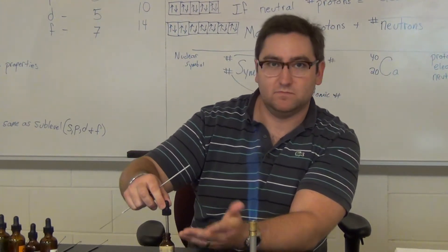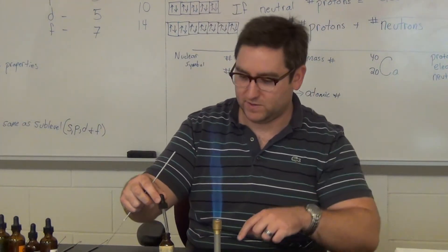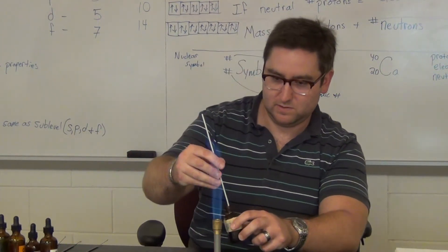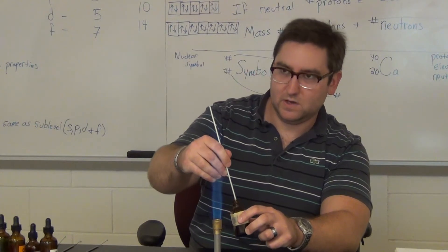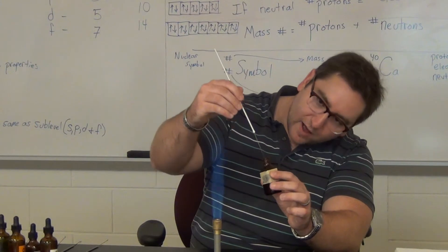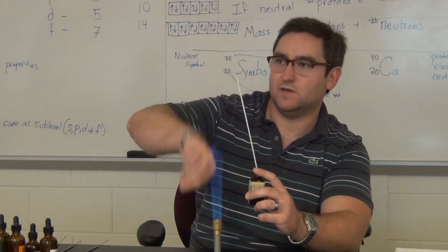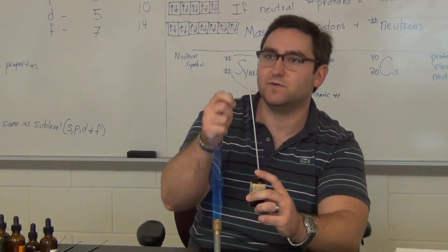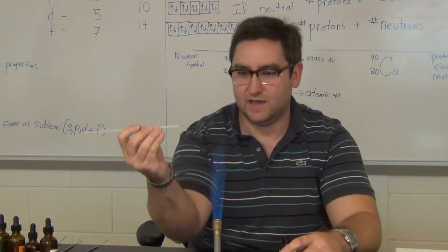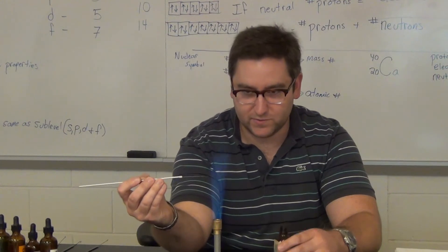I'm going to do each of them three or four times so you can get a good view of it. If the camera's in your way, you can move if you need to. I have this metal stick that has a loop on the end — it works just like those things you have when you're kids where you blow bubbles with soap. It's going to hold a little bit of liquid in the center, and when I put it in the flame, I'm going to burn off the liquid. So here's our calcium.